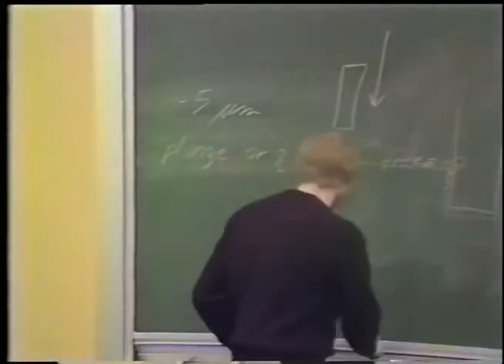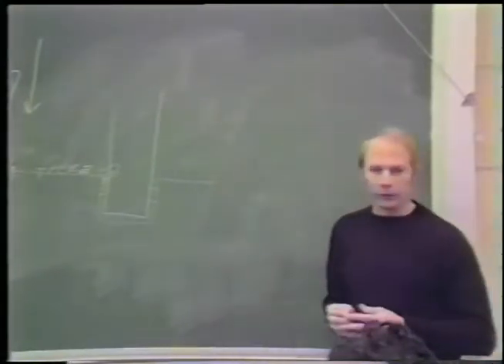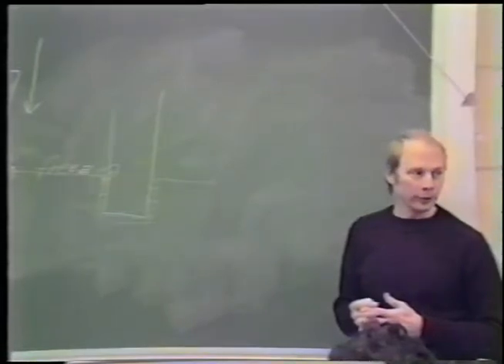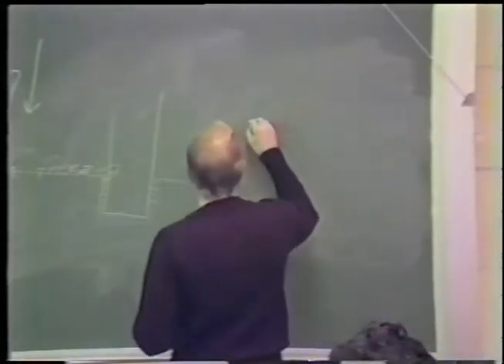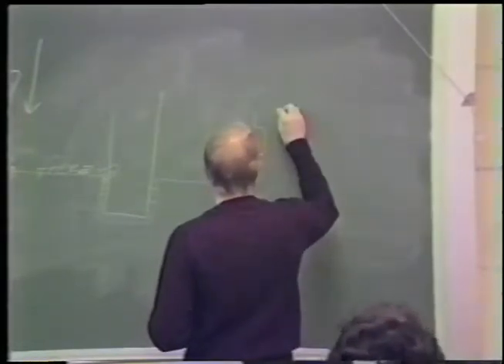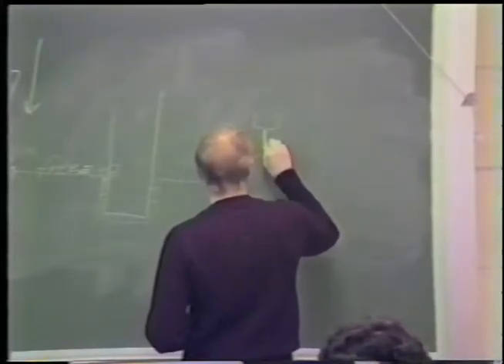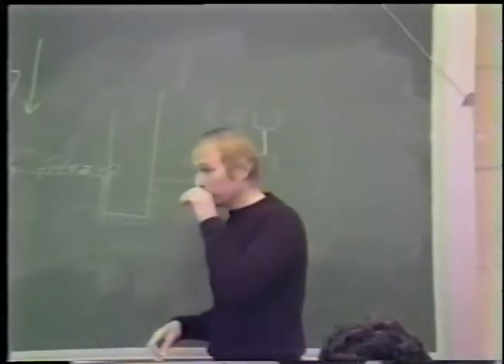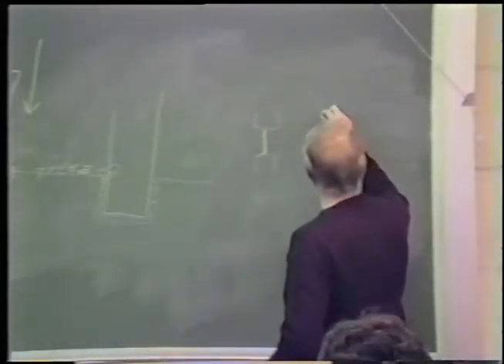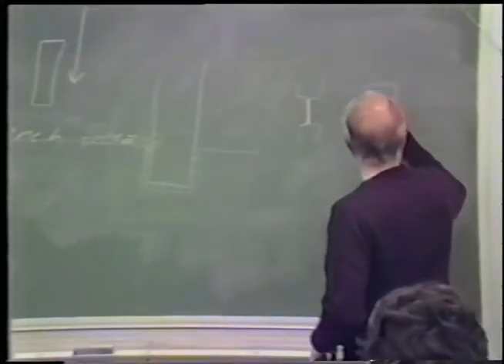And the optimal shape for the sample turns out is to have a very thin layer of the sample between two metal specimen carriers. And looked at end-on, for plunge freezing, those would look this way, like this. And with the sample in between. This is a cross-sectional view end-on of the metal specimen carriers. Carriers that have been developed, looked at from the top, would look like this.